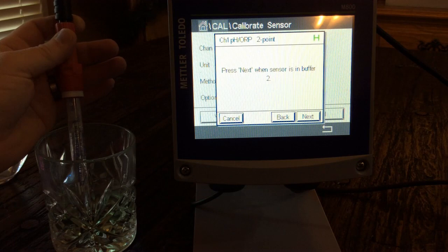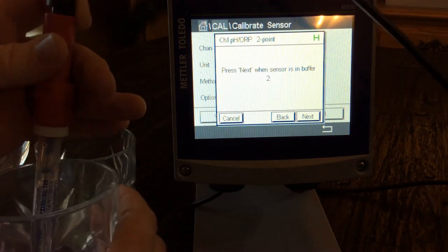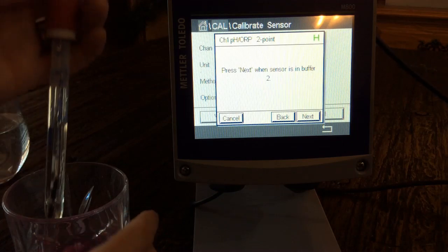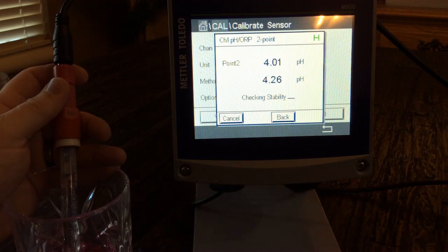We are done with that calibration. We take the sensor out, put it into our cleaning solution, then put it into our second buffer — the 4 — as prompted, and hit next.